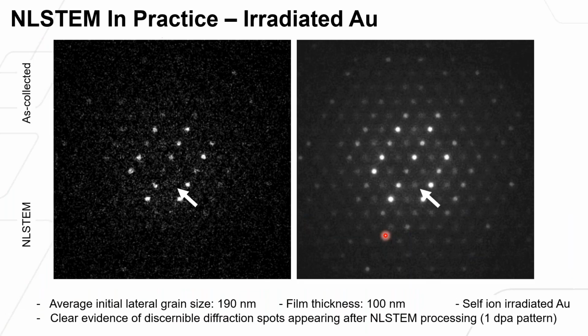Well, there are two effects really. One of them is we're just increasing the signal to noise ratio, right? You average patterns together, it's going to increase the signal, decrease the noise, increasing the success that you have for these template matching algorithms. But you also have a secondary effect as well.